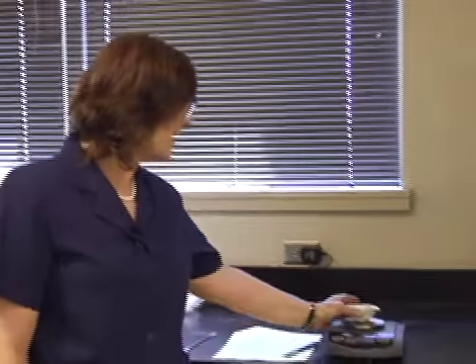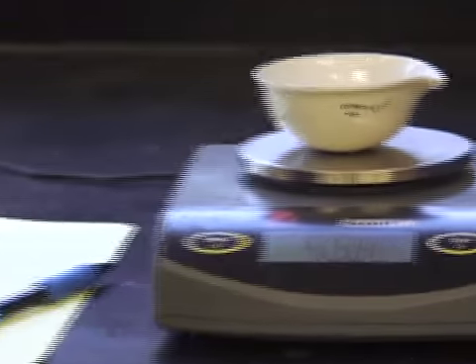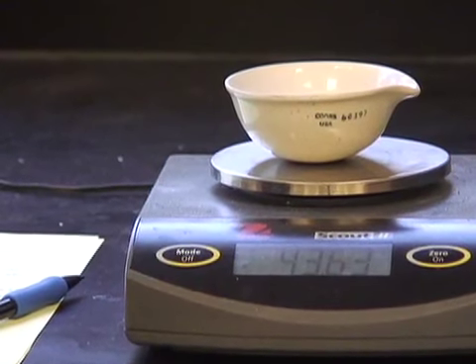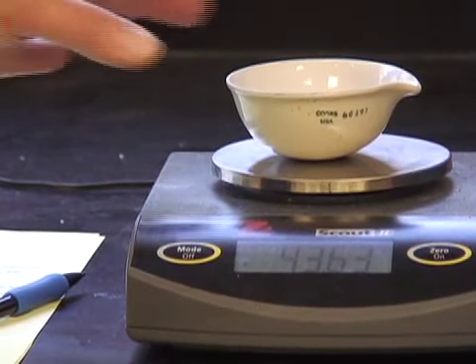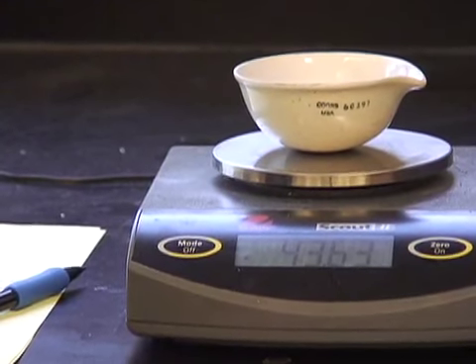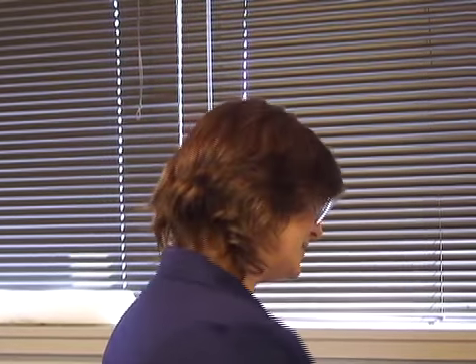Here we are at the scale, and I'm going to go ahead and zero it out, and then we are going to measure the mass of an empty evaporating dish. And here's my evaporating dish, and I'm going to get the mass of it empty. It's critical that I get the empty mass. And it is 43.63 grams. 43.63 grams is the mass of my evaporating dish.